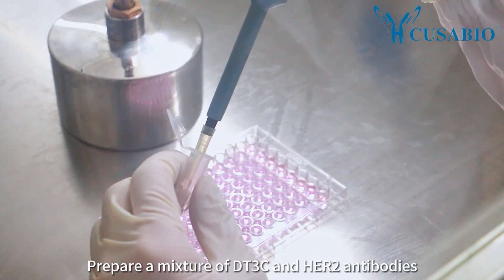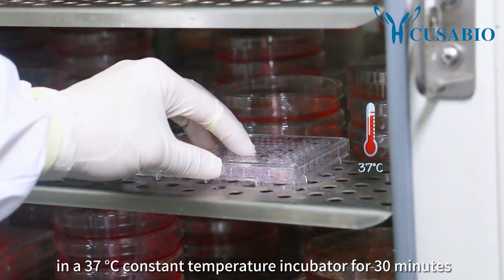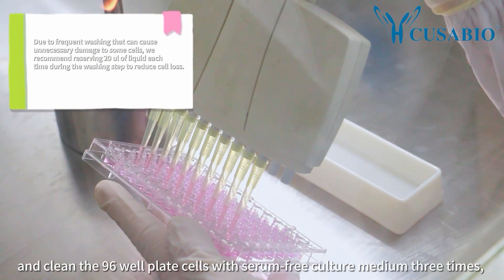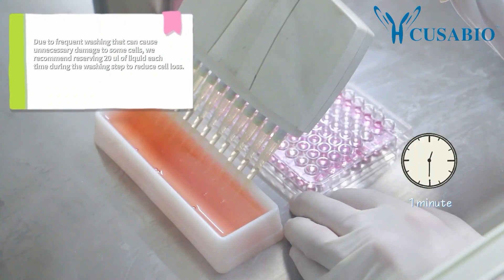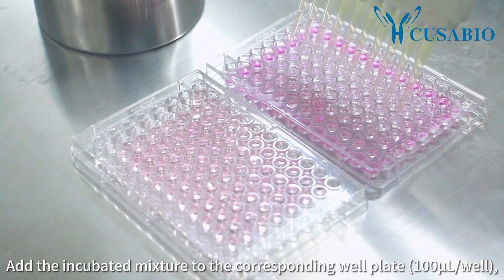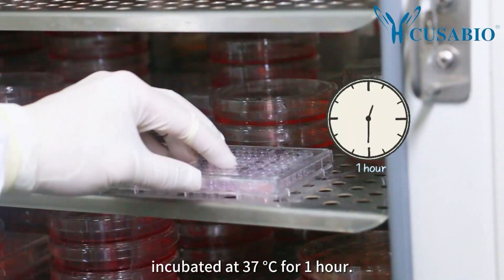Dilute DETEC and HER2 antibodies using serum-free medium and filter for sterilization. Prepare a mixture of DETEC and HER2 antibodies at the corresponding concentration and incubate in a 37°C constant temperature incubator for 30 minutes. Remove the culture medium and wash the 96-well plate cells with serum-free culture medium three times, each time for one minute. Add the incubated mixture to the corresponding well plate at 100 µL per well and incubate at 37°C for one hour.